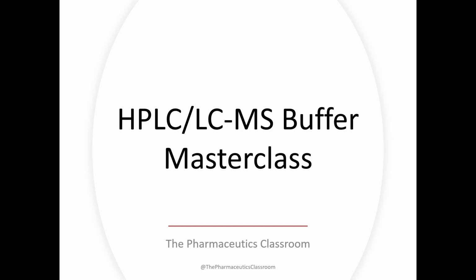Today we'll discuss the HPLC and LCMS buffers, why they have been used in chromatography as a mobile phase. So today we'll discuss everything about the buffers.